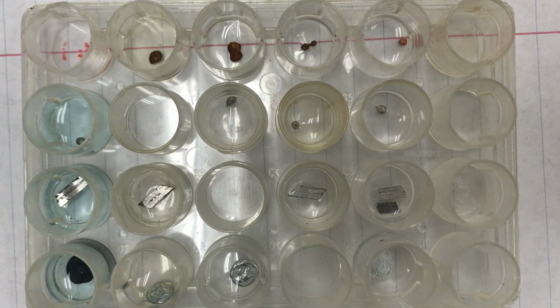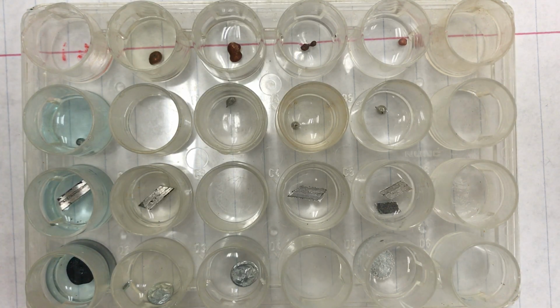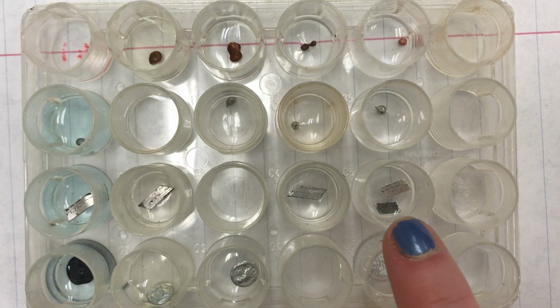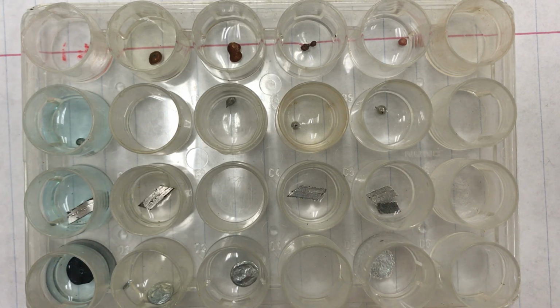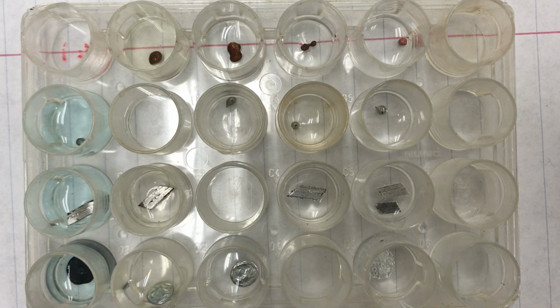Okay, so that's happening. We can see some other changes that are going on here. They're going to be subtle changes, so make sure you're looking closely. For example, we can see that this piece of magnesium is moving around here, okay? Look at what is forming and would be causing it to move around. Take a look down here at this well plate. Notice what's happening here, okay? So you're going to have to look closely to see some of these changes. I'm going to let this run for about 5 minutes so that you can see any changes that would happen over a 5-minute period.